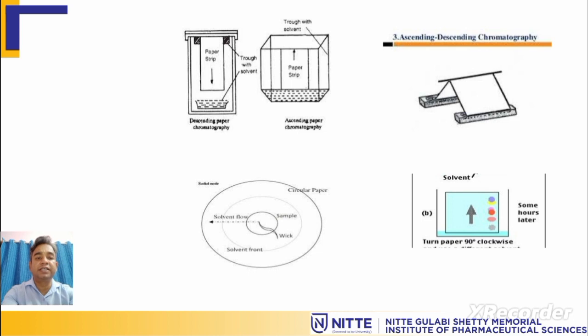We have already seen this in a previous video. So here is a pictorial aspect of all those development techniques: circular development, two dimensional development, ascending development and descending development.